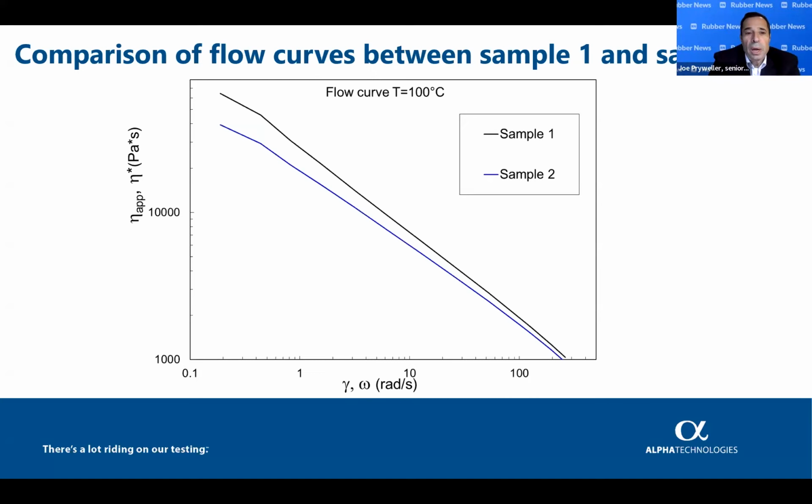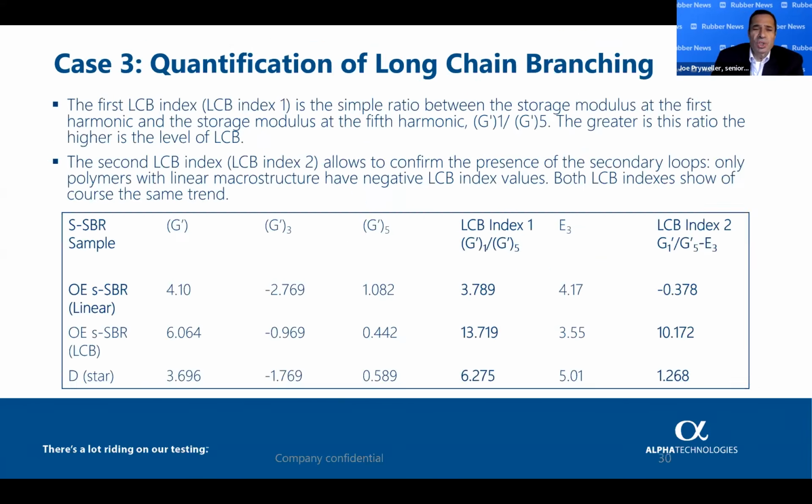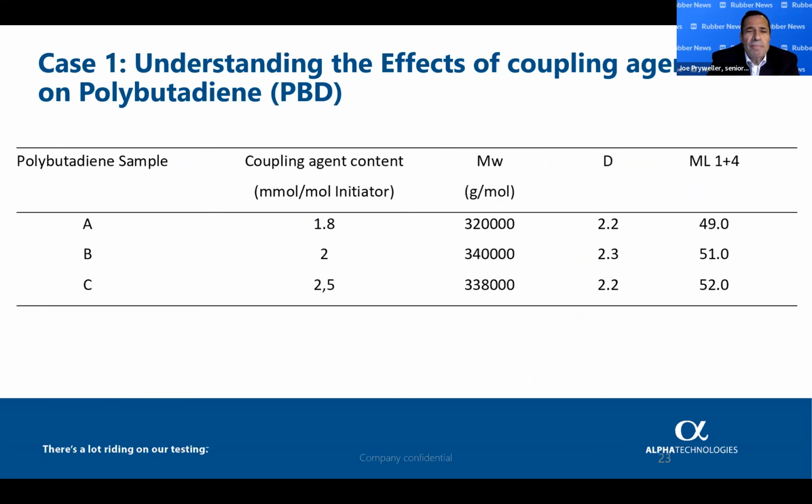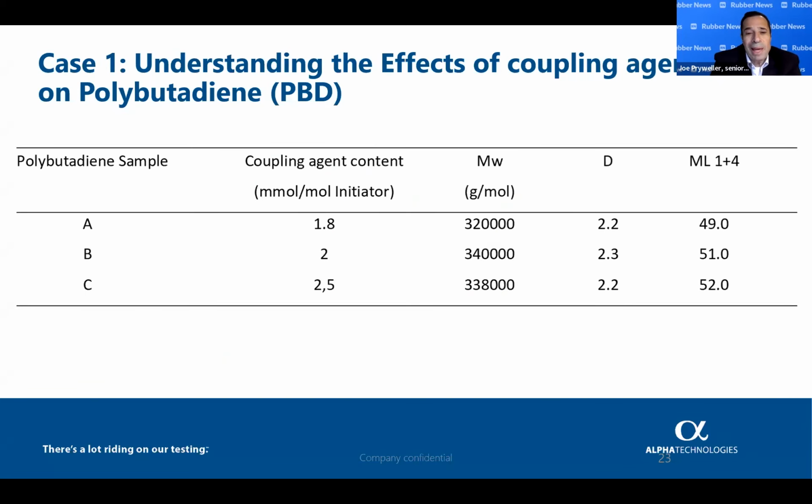Okay, thanks, Michele. Case study number one, again, a question about that with using PBD and compounding agents, coupling agents, excuse me. You show that Mooney viscosity showed no distinction versus the LAOS plot. Would Mooney SR have shown any deltas with this? So the Mooney, in this case, Mooney stress relaxation is the additional test that was mentioned.